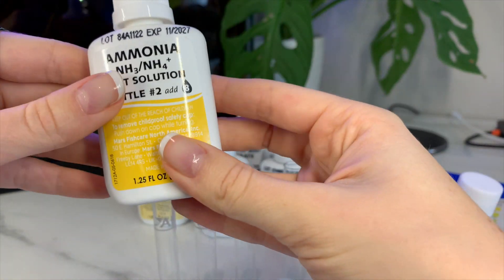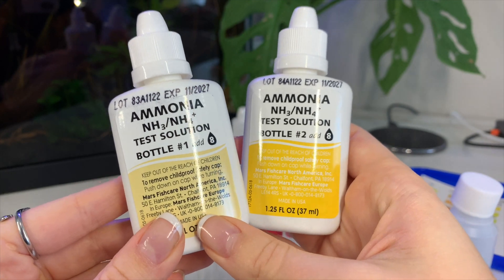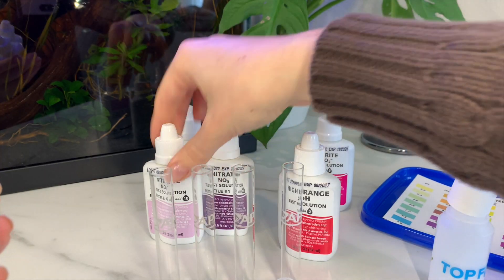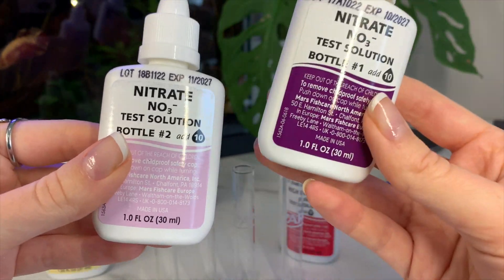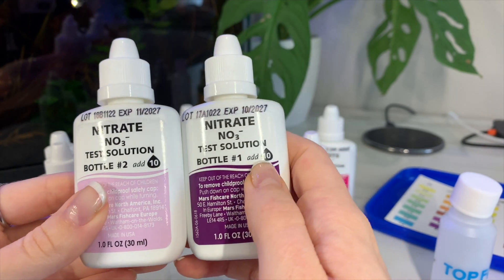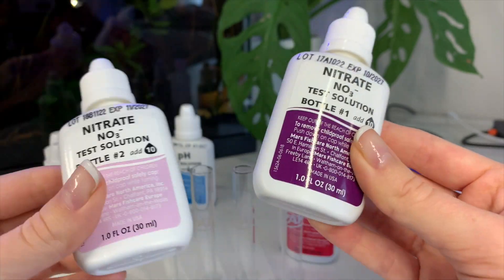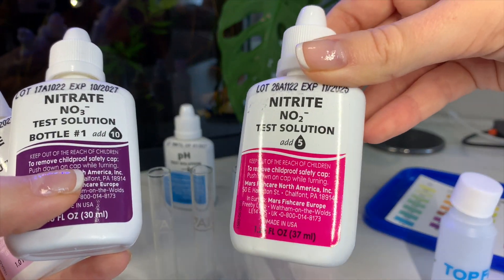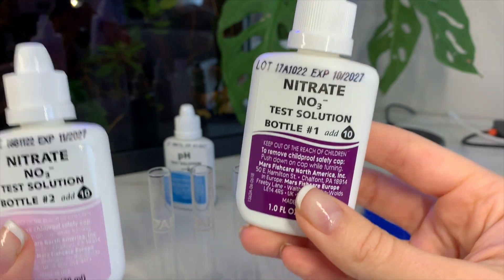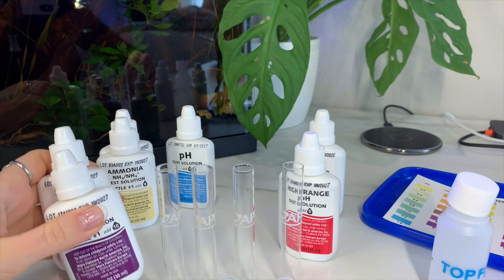Let's quickly go over each bottle and what they mean. This bottle tests the ammonia in your water, and you actually have two bottles — which is where my earlier explanation comes in. Ammonia has bottle number one and two. Most of them only have one bottle; the nitrate and the ammonia both have two bottles. My error occurred when I only used one of them — nothing happened. You're supposed to use them at the same time: 10 drops of bottle one and 10 drops of bottle two into the same vial. That is how you get the right reading.